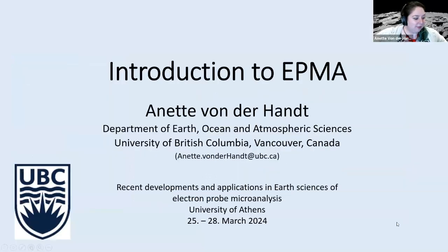Okay, yes. Excellent. So I will give the first 3 presentations of the day as kind of an intro and primer, specifically for people who are not that familiar with the technique. And just as a caveat, while they're like 40 minutes each, microprobe is of course a very versatile technique.